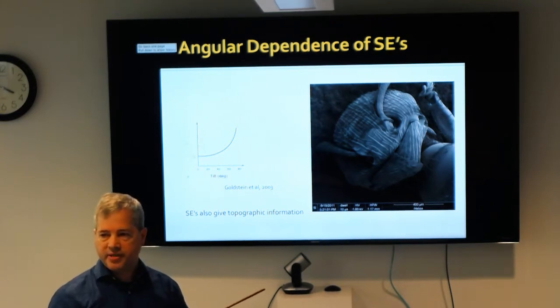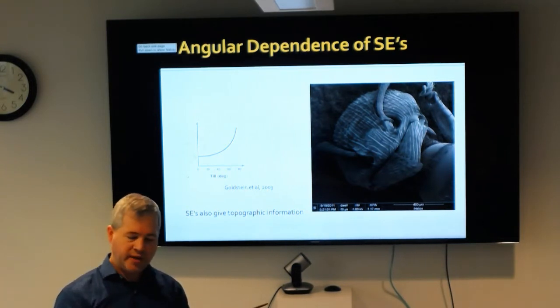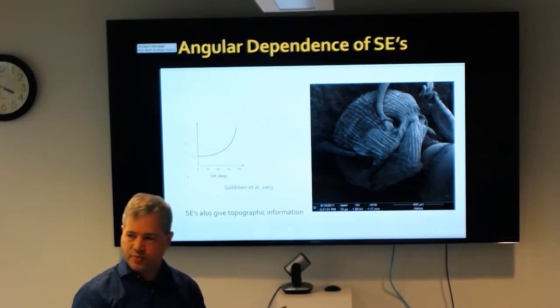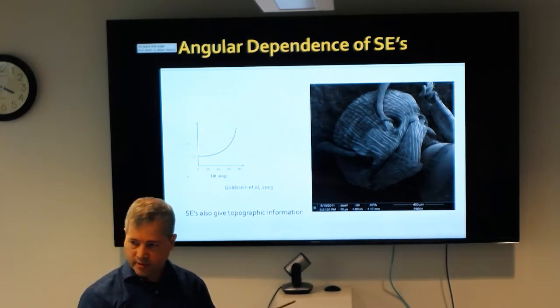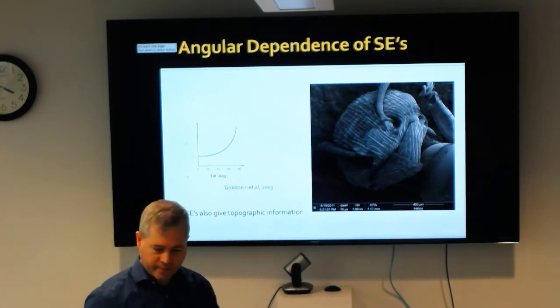So it's much less fine. The grain is a lot more coarse. You can do it under higher vacuum to get a finer grain, but we generally are just doing it to make it conductive, so it's not so fine. It's a pretty fast procedure. It only takes a couple of minutes. I can show you the coater after class. We have it out there.